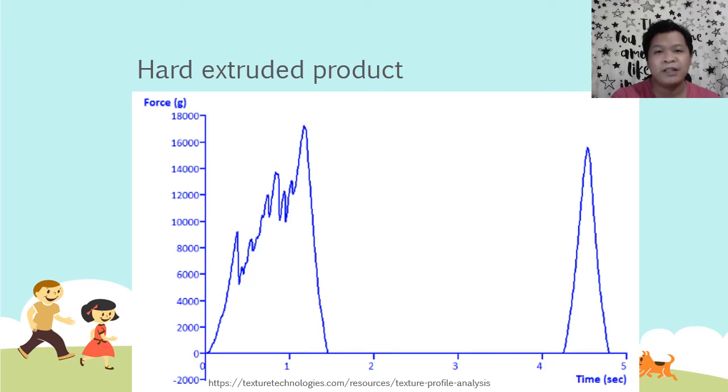And of course, the fracture pattern at least followed na yung hardest point occurred at the deepest compression. So, weird pa rin, no? Hindi surprising given the brittle nature of this product that it also has no adhesion, absolutely no adhesion between strokes.